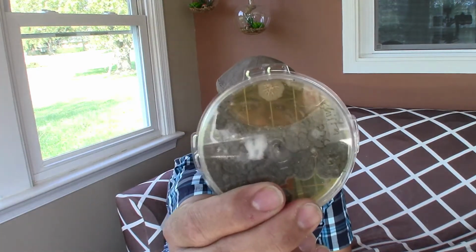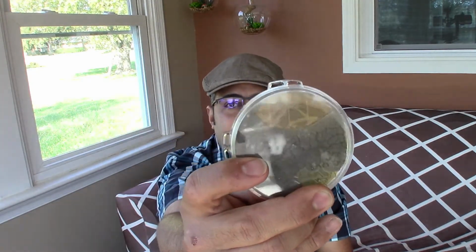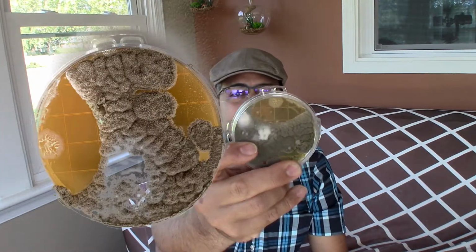Now, what I want to show you today is this. This is a contaminant. In this specific plate, as you can see, mold is growing.